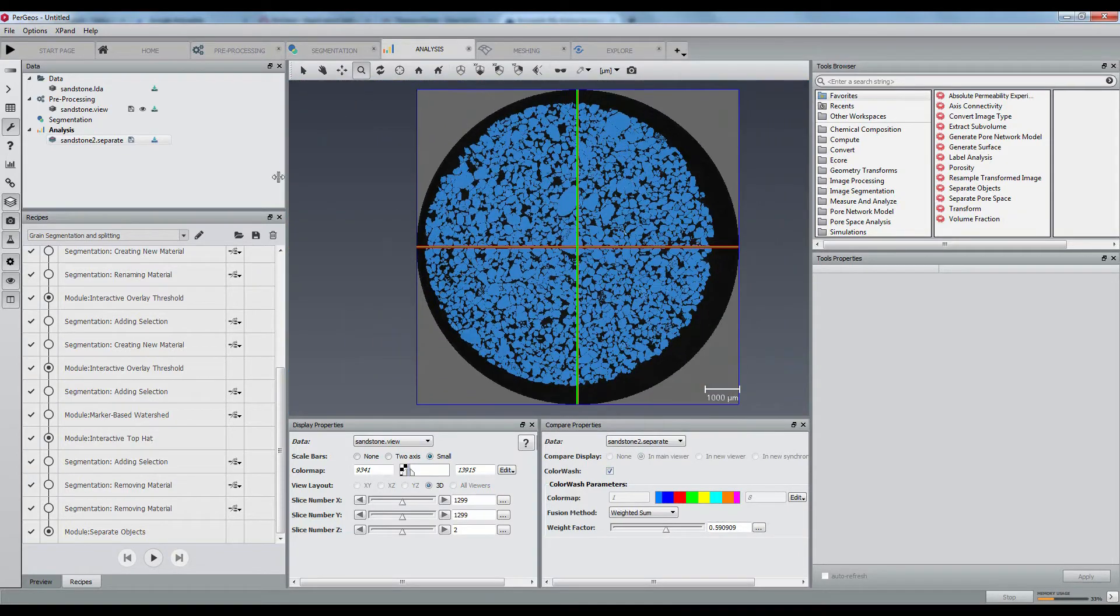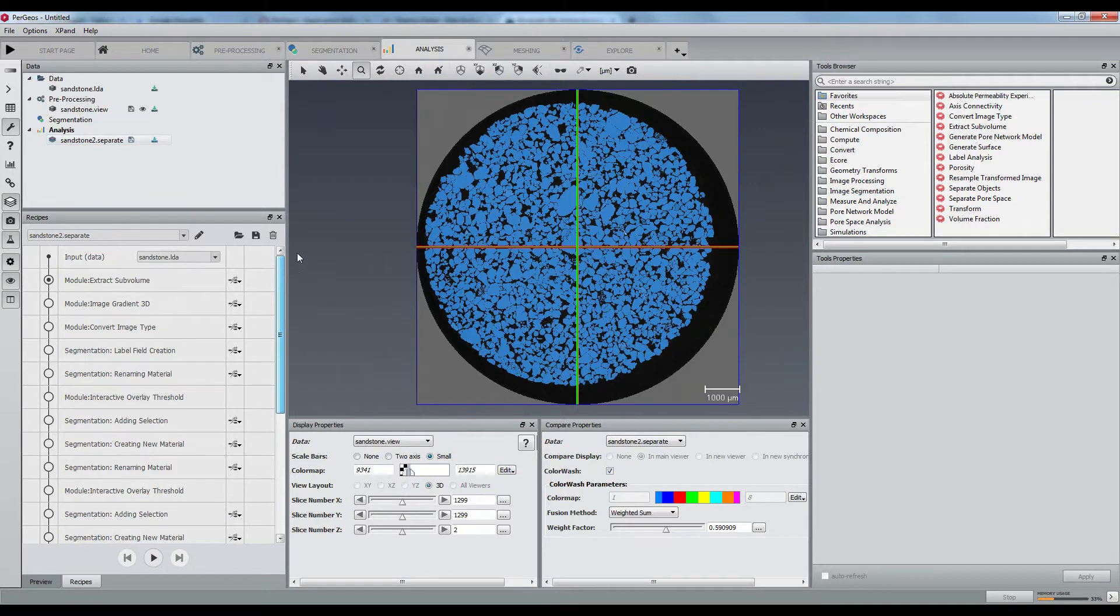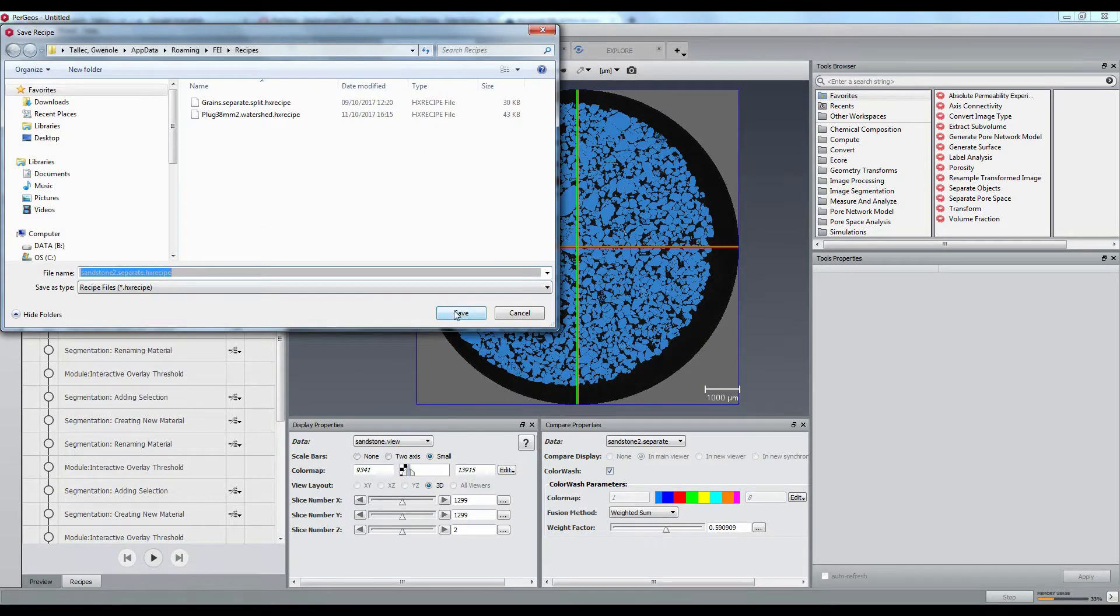Let's now save a new recipe in order to keep trace of all parameters after having removed the Extract Subvolume step.